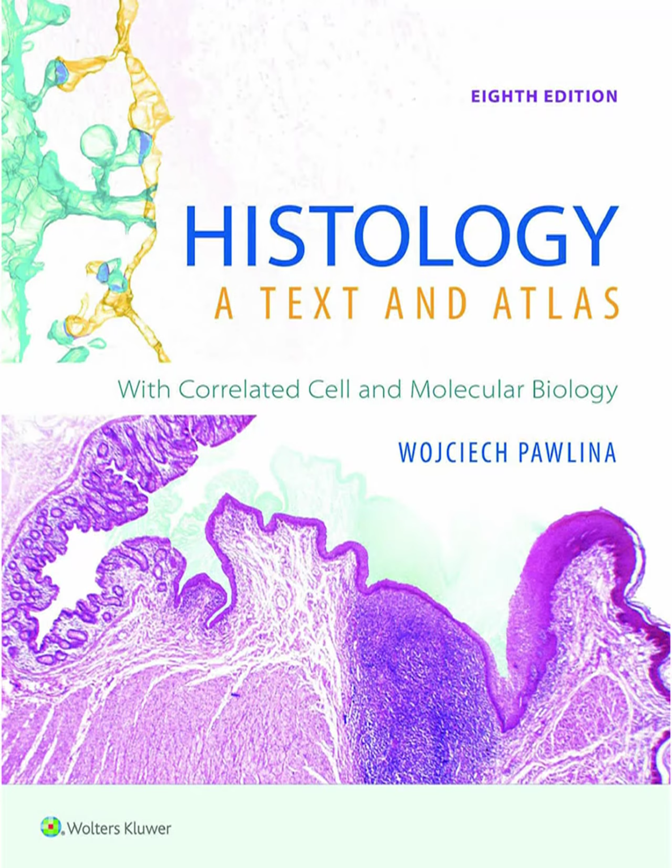Precisely. And building on that is light sheet fluorescence microscopy, or LSFM. This is really powerful for imaging larger, thicker, often transparent specimens. Instead of illuminating the whole sample, it uses a thin sheet of laser light to illuminate just one focal plane at a time. Like optically slicing it. Exactly. You move the sheet or the sample and capture a stack of these optical slices, which you can then reconstruct into stunning 3D images of labeled structures deep within tissues, often with minimal photo damage. Great for developmental biology. Wow. More ways to see 3D.